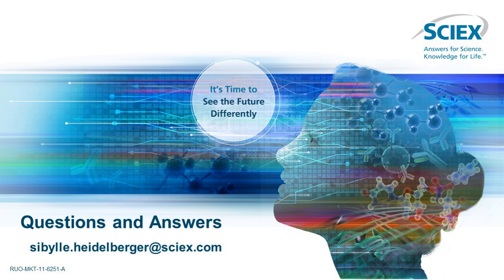And do I have to define what modifications I'm looking for before I set up the method? No, that's one of the key things about using a swath acquisition. You don't need to know anything about the sample before you set it up. Everything that happens is in the processing of the sample, and that's where you may define what you're actually looking for. But when it comes to the acquisition, you do not have to worry about anything, and that's what makes it so unbiased.